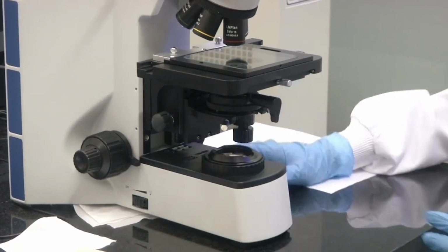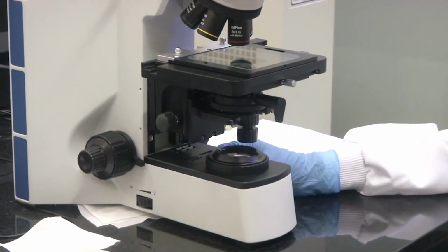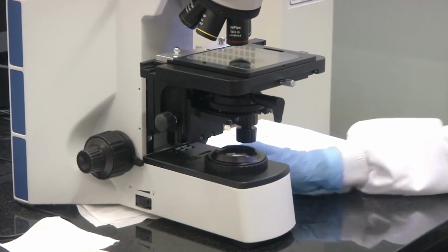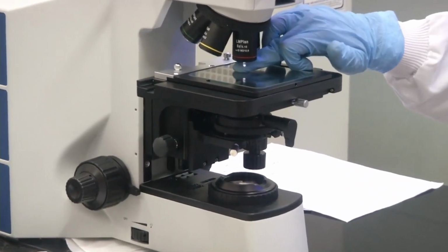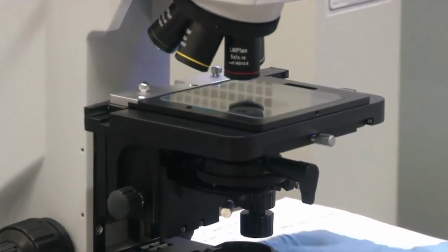Switched off. Similarly, on the other side, you might not be able to see, there is another knob with which you switch on the top illumination. So I have switched on the top illumination. See my gloves, and the top illumination is on.